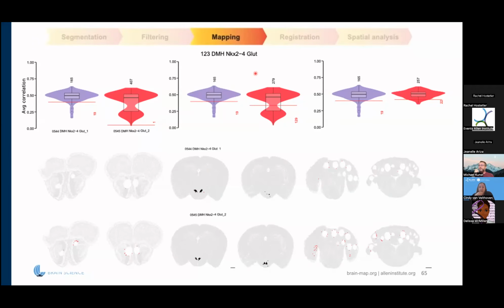So the way we go about that is we first identify cells that are bimodal based on comparing the potential peaks, then basically cut them through the trough of the distribution, and then we apply the median absolute deviation threshold again. So this is what you see here in the lower set of cells. And again, you can see that the cells we find are not near the hypothalamus, they're also associated with low quality regions. So now we have probably reached a stage where we are done with our filtering and we have a high quality data set.